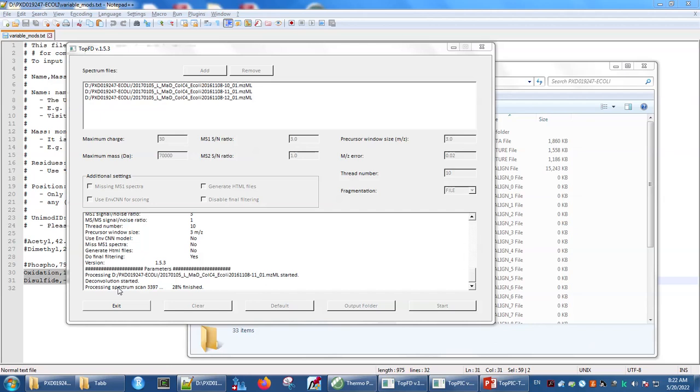Okay, so we're already onto the second file. We see that the time required is not punitive, but there's not a huge amount of stuff for me to say. So I will try to think of what else I would report on this.